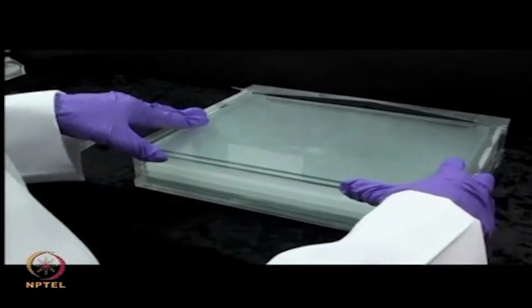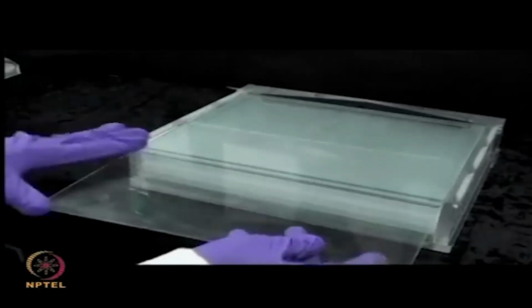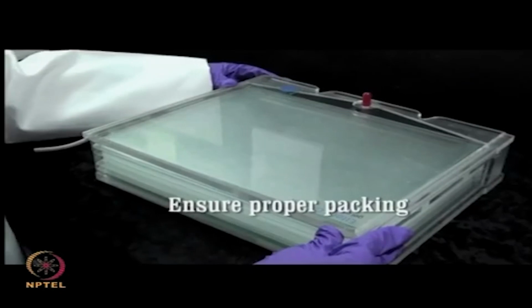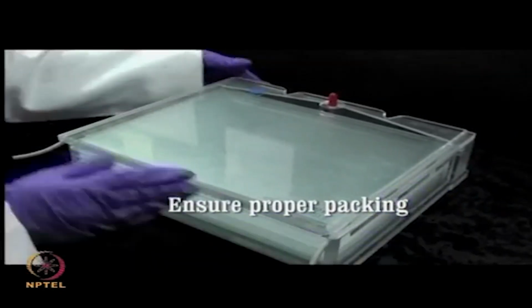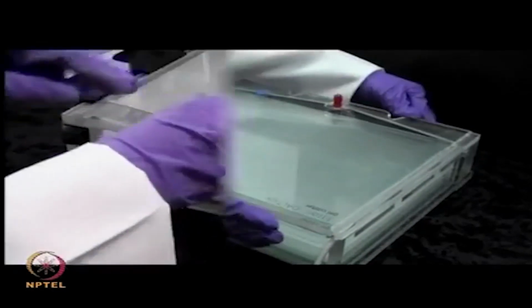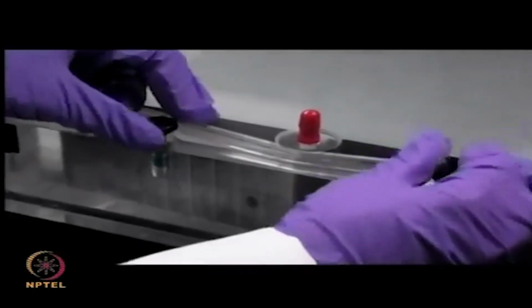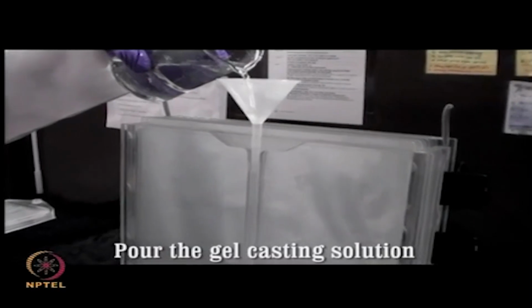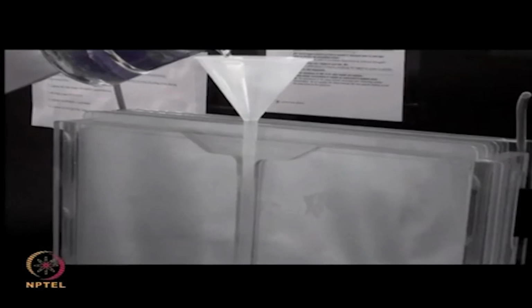Assembly should be tightly packed such that there are no leaks. Close the casting assembly and tighten the screws provided. Prepare the gel casting solution consisting of acrylamide, bisacrylamide, Tris chloride, SDS, APS and TEMED, and pour it with the help of a funnel into the central channel of the casting assembly.